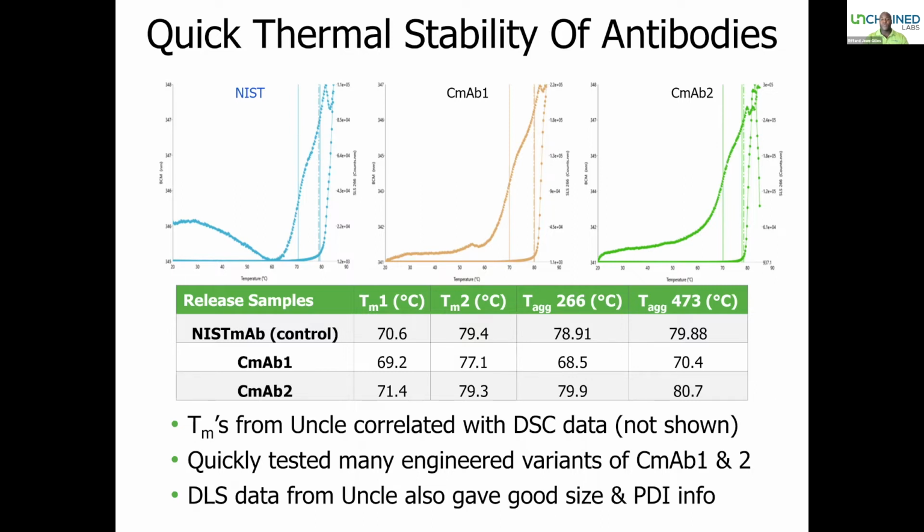So what we're not showing you here is that those samples were measured by DSC, and the data correlated very nicely with DSC.